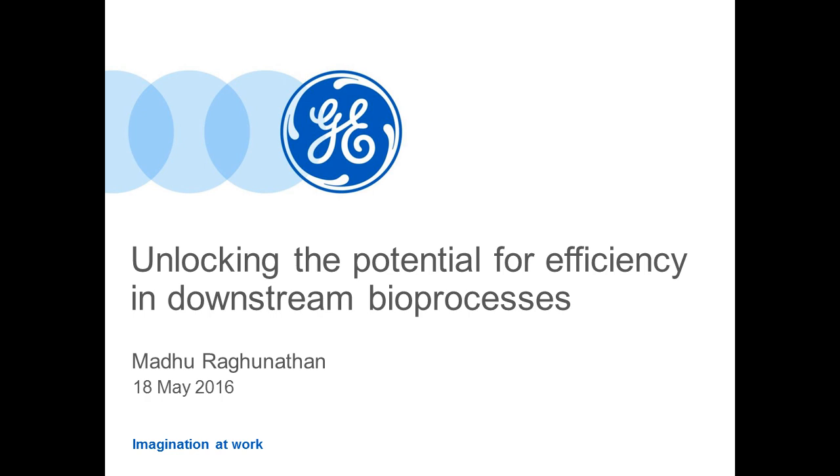The reason for that is when you're doing, for example, clinical manufacturing or low frequency manufacturing, you aren't nearly utilizing the full life cycle of the resin, and therefore, I'm specifically talking about continuous chromatography here, putting in place continuous chromatography is really beneficial at that scale.